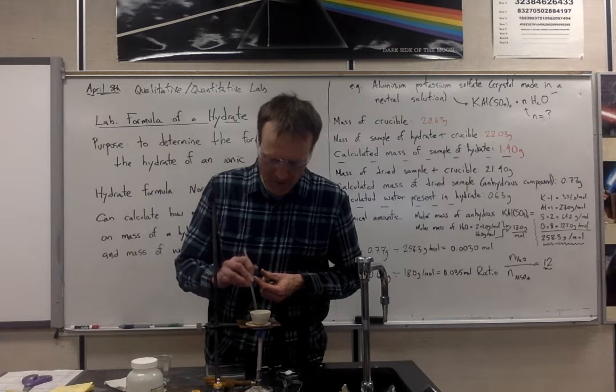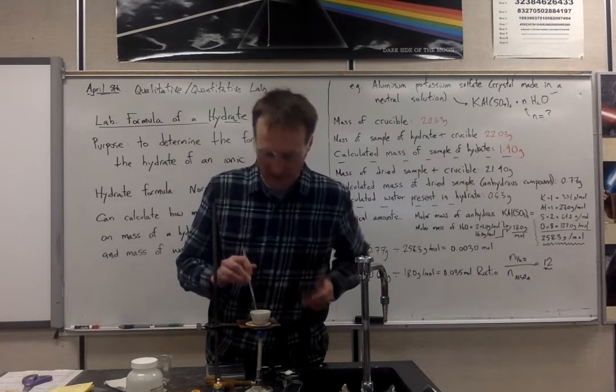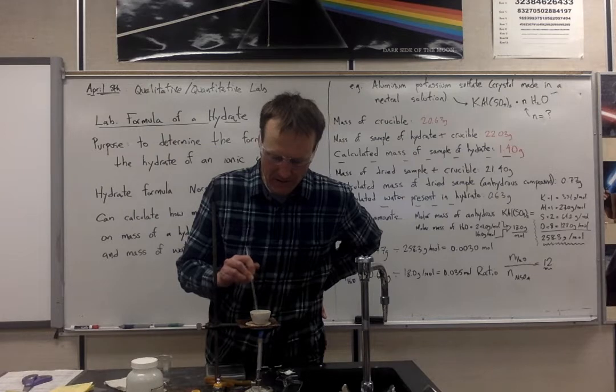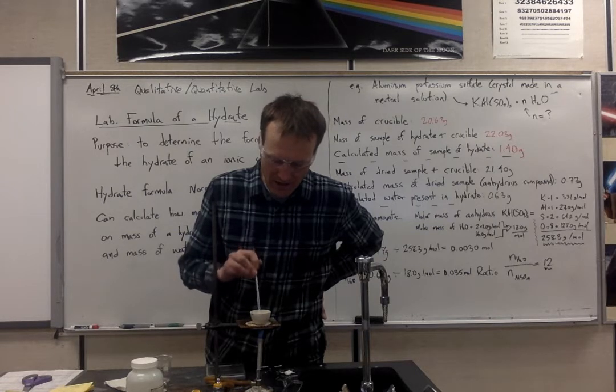Another observation I would make here is that there does appear to be a lot less, which there really is. The water is a significant part of the mass of the original crystal. I've now made it into a very pale colored, fine powder.